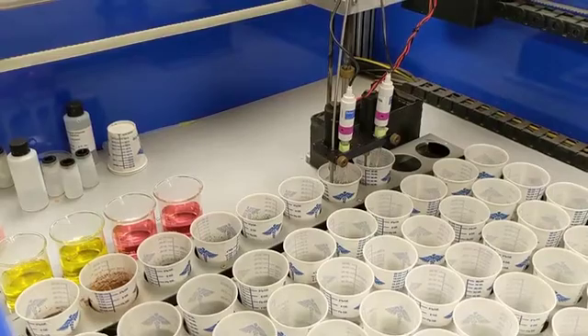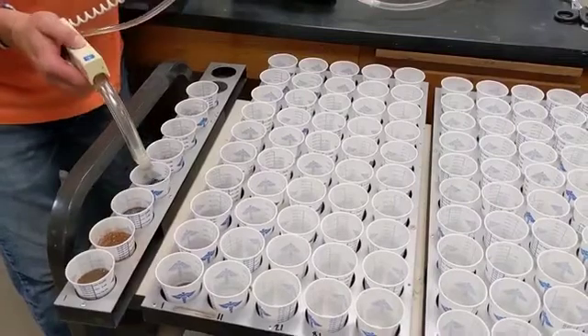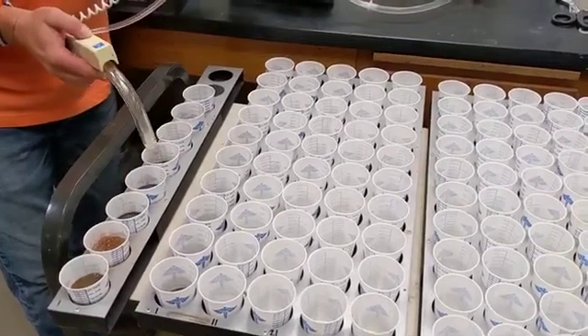Next, 15 milliliters of buffer is added to each sample, and another pH analysis is run.